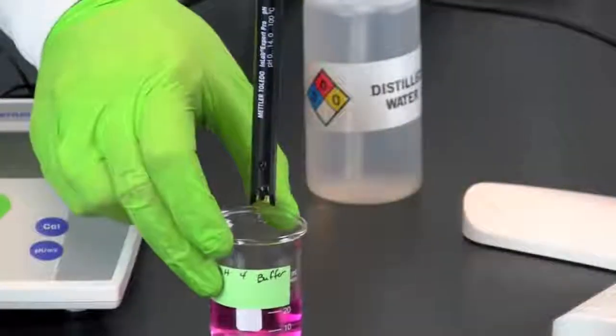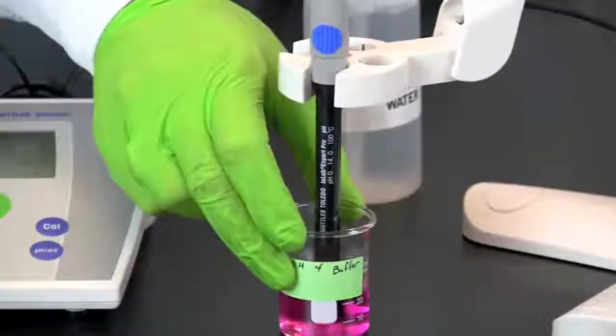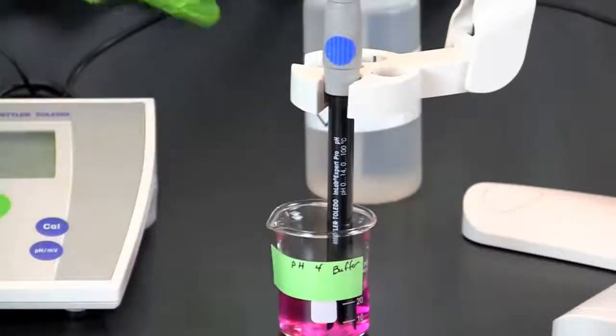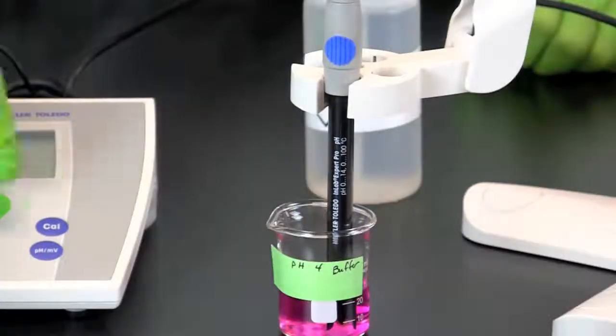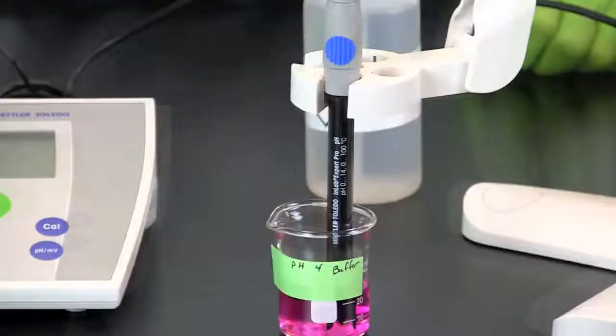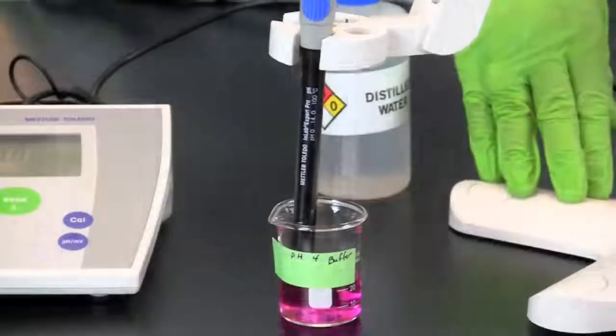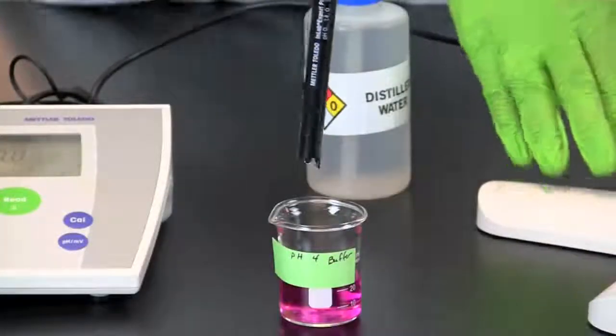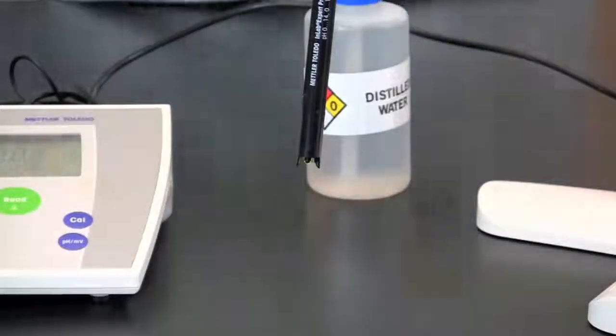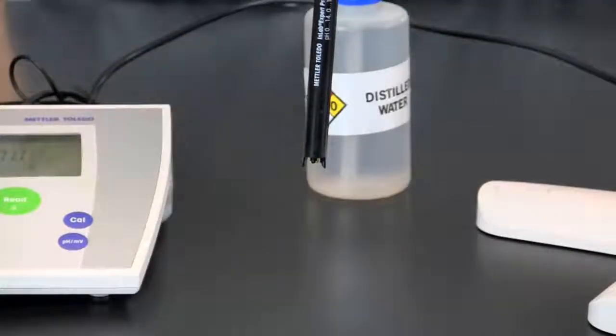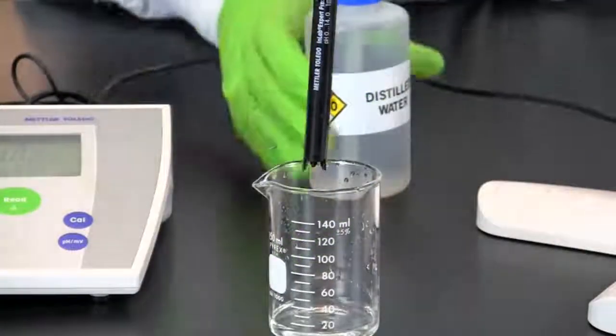Repeat the process again, this time using the standard with a pH of 4. Once the standard has been calibrated you will need to remove the sample and again rinse the electrode with distilled water.